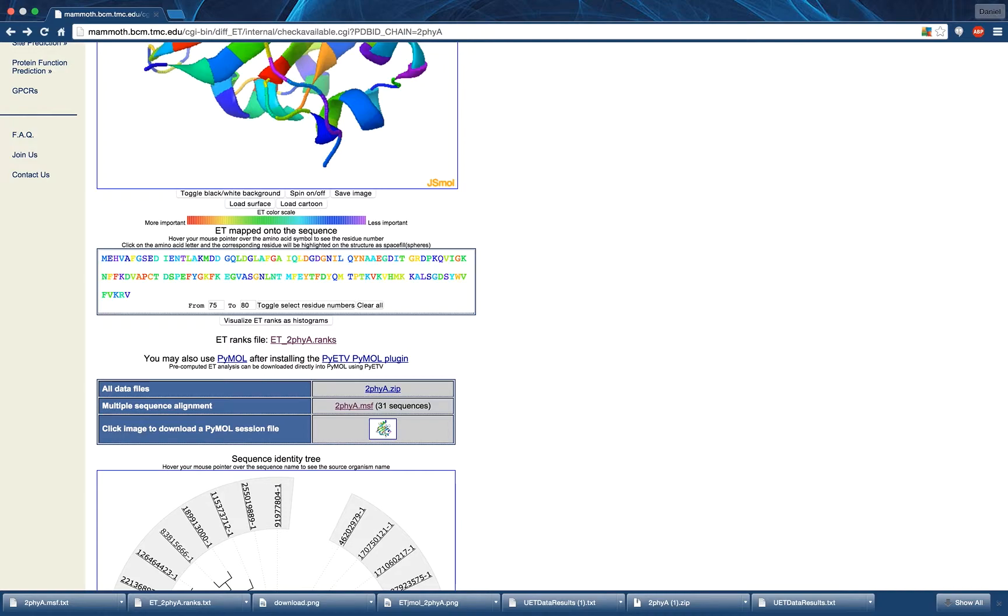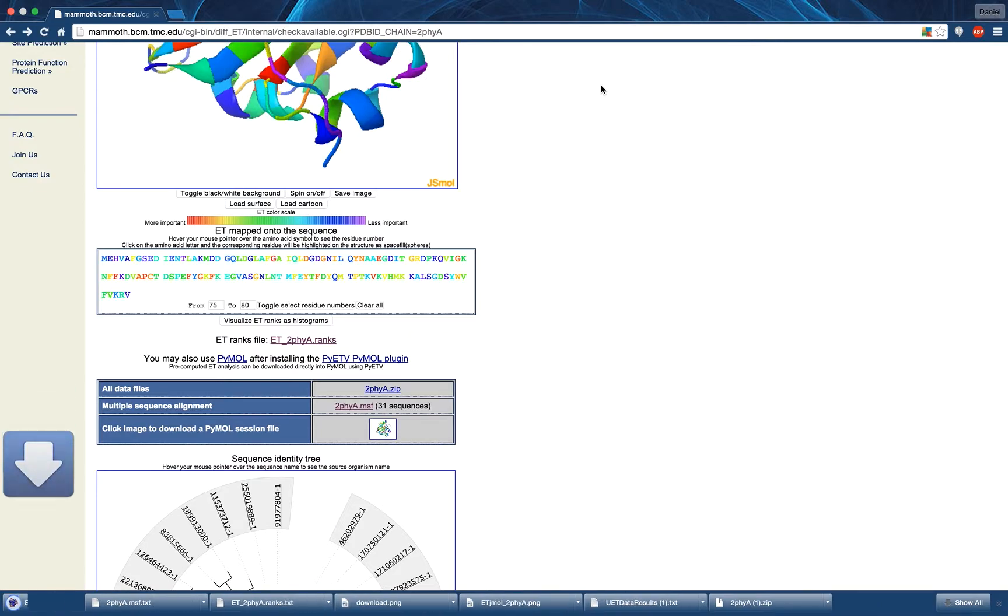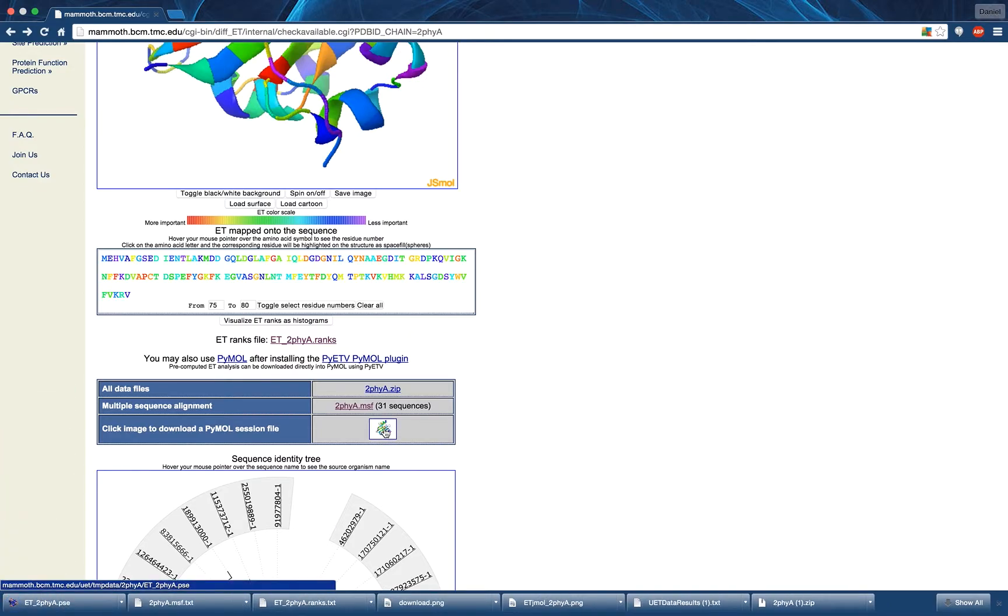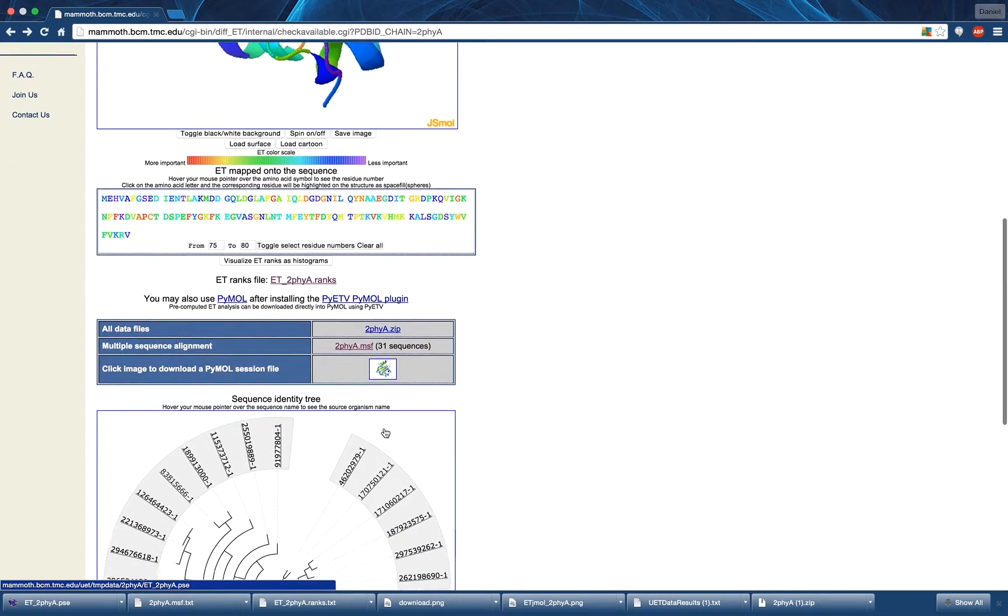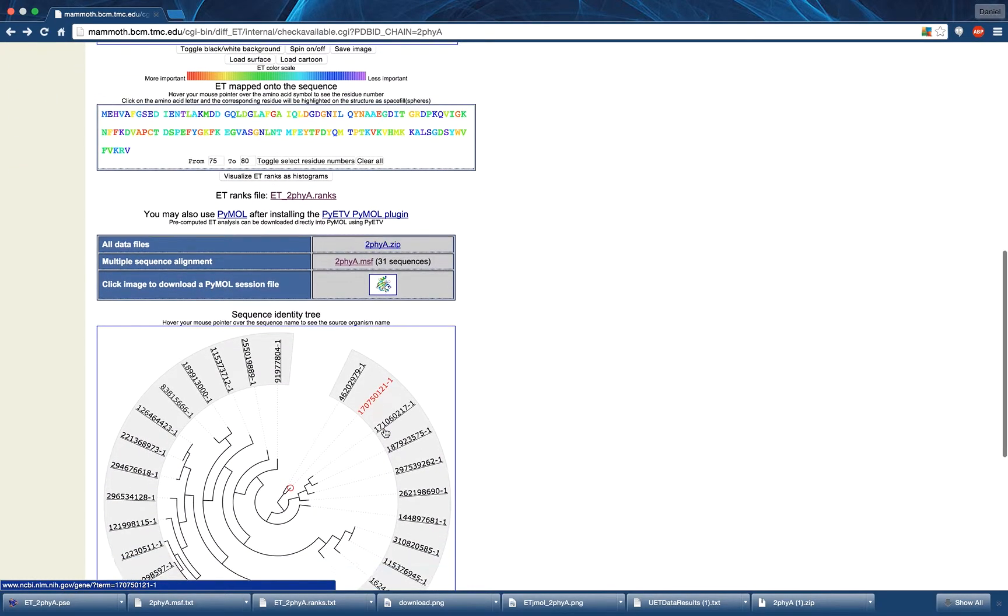Finally, you can download the PyMOL session file generated during the trace of this structure. The next section of the results page displays the phylogenetic tree created during the trace of this structure.